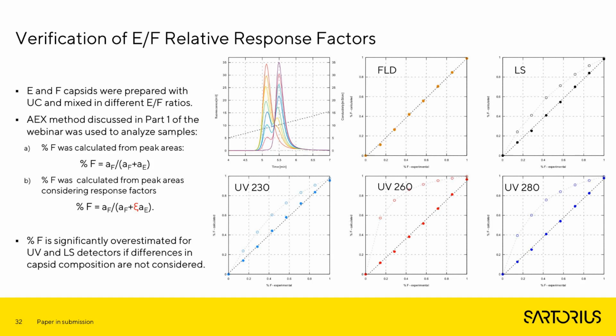Whereas if we take into account this response factor, we can basically align the expected and experimental empty to full ratios into a linear form. So basically, by implementing the response factor, we can use any detector to accurately quantify the empty and full ratio in any AAV sample.